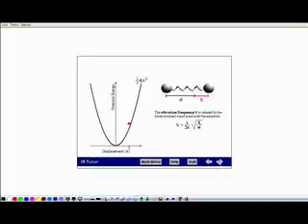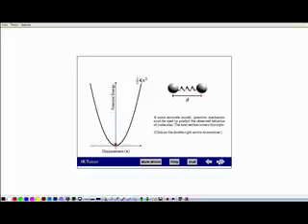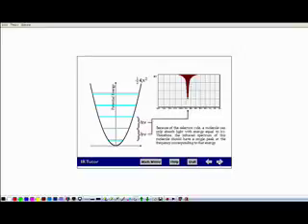And if they're really big, they don't vibrate as fast. If they're really small, they vibrate faster. What we're interested in is that as those molecules absorb infrared radiation of that particular frequency, you end up with a peak on the infrared spectrum right here, which tells you basically what the vibrational frequency was. The position of the peak on that spectrum is going to tell us which functional group I have, because the different functional groups have different vibrational frequencies. Okay, so that's the basic setup for this.